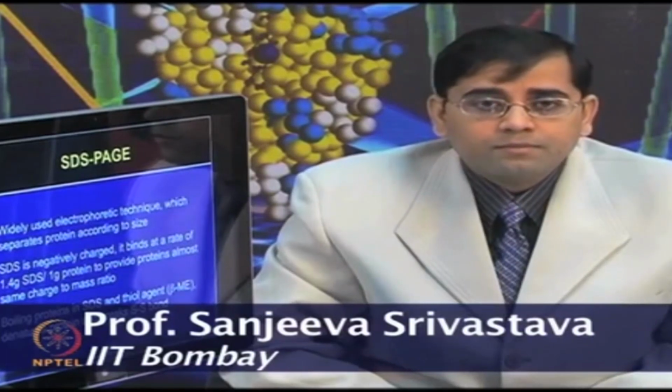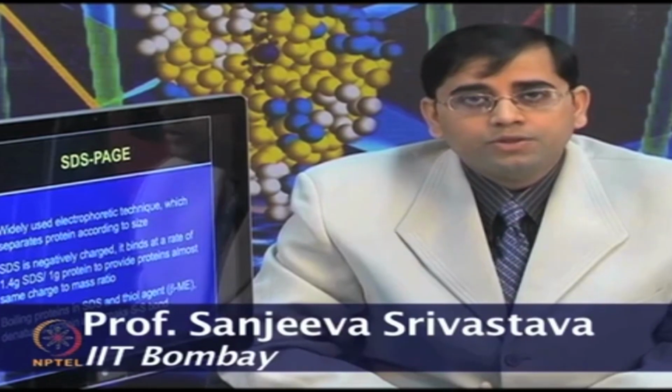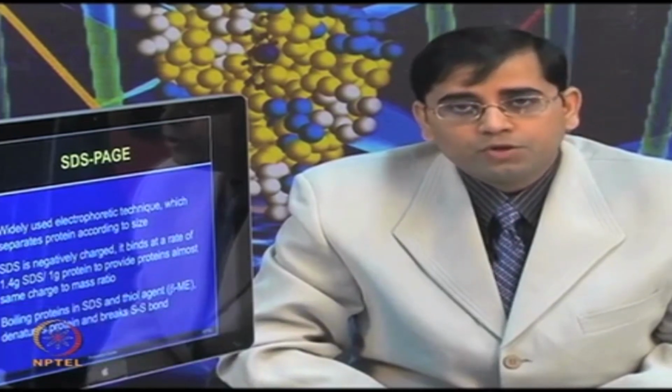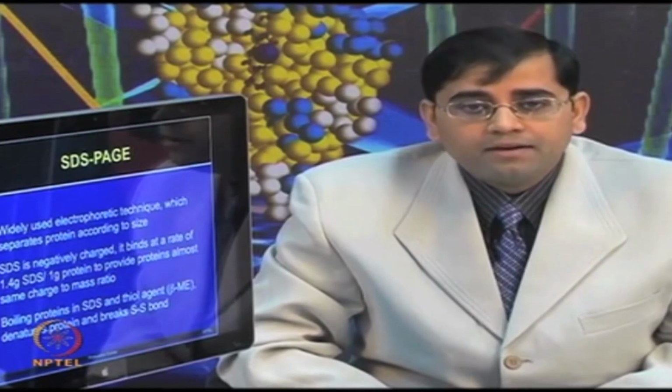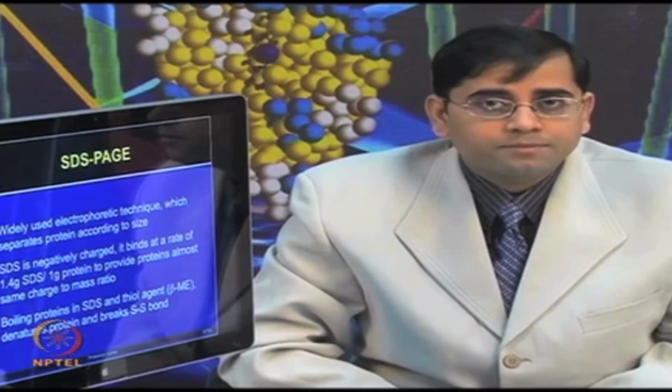As I mentioned, there are steps required to prepare your protein for denaturation. You need to boil your proteins in SDS and beta-mercaptoethanol or DTT to denature the protein and to remove or break any disulfide bonds.